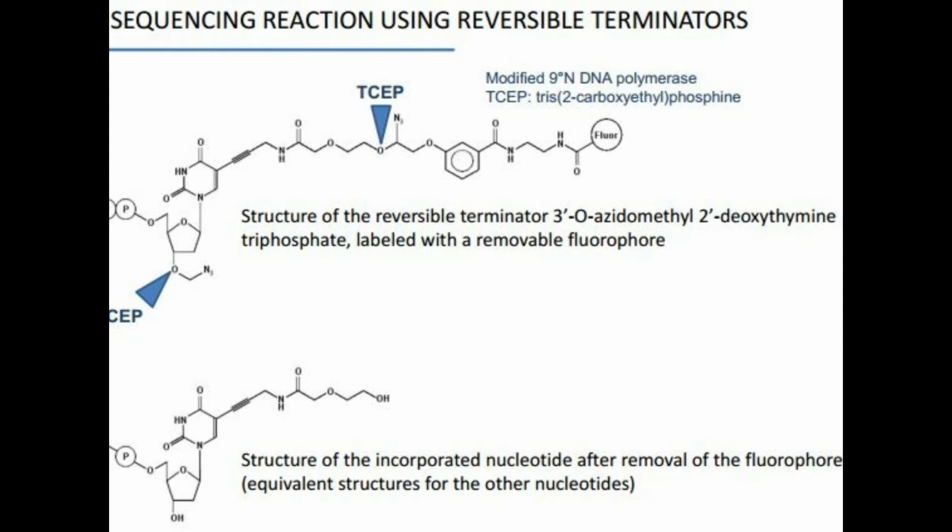And this helps the particular stage of analysis because every time the polymerase comes and binds with the new complementary nucleotide, it will not read the previous nucleotide's fluorophore, and the laser will excite the new dNTP's fluorophore. So in Illumina sequencing technology, the cluster is generated in the following fashion.